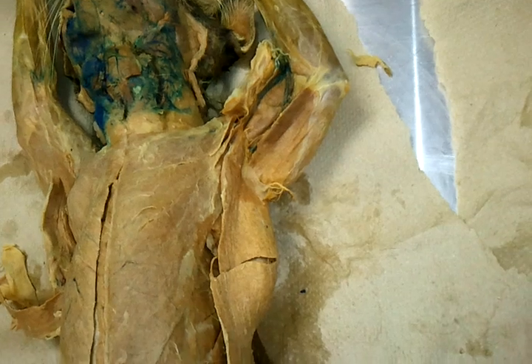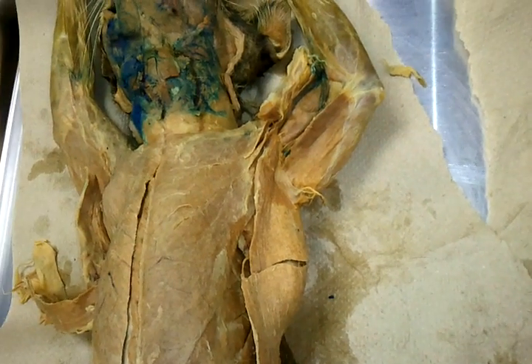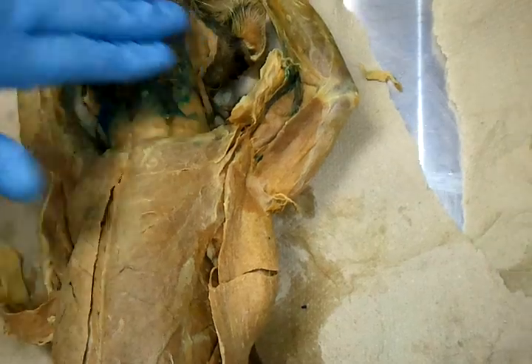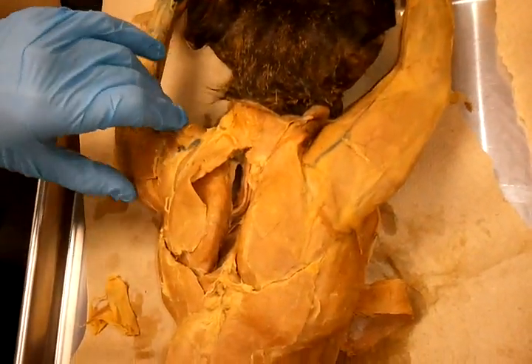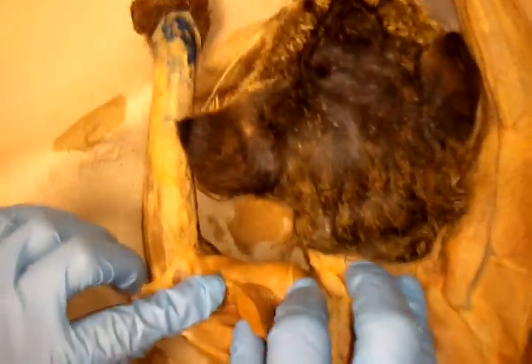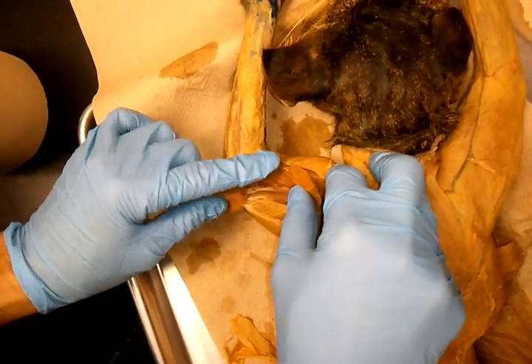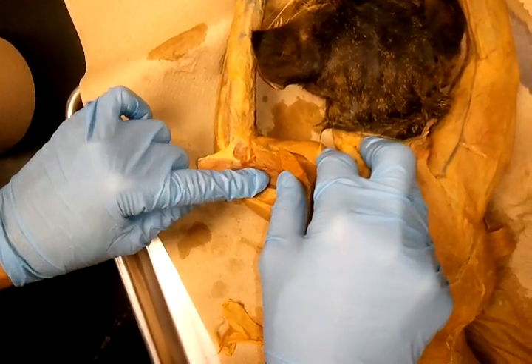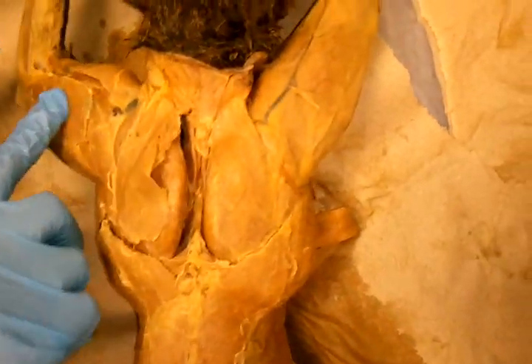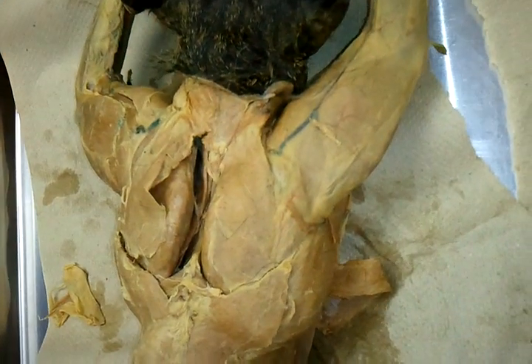Brachialis is anterior to the medial head and deep to your triceps brachii lateral head.